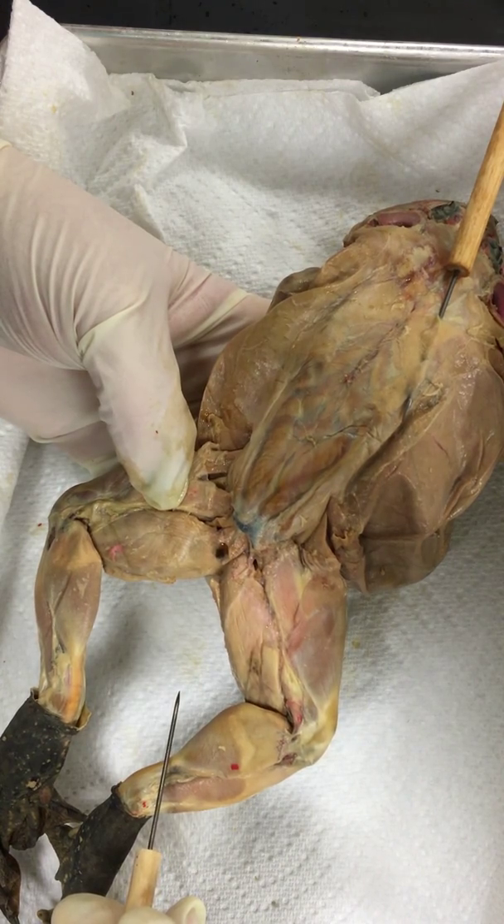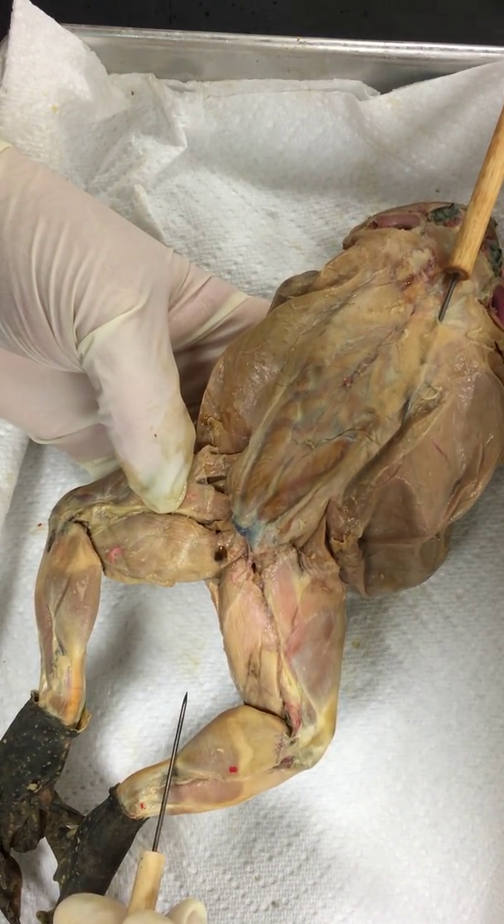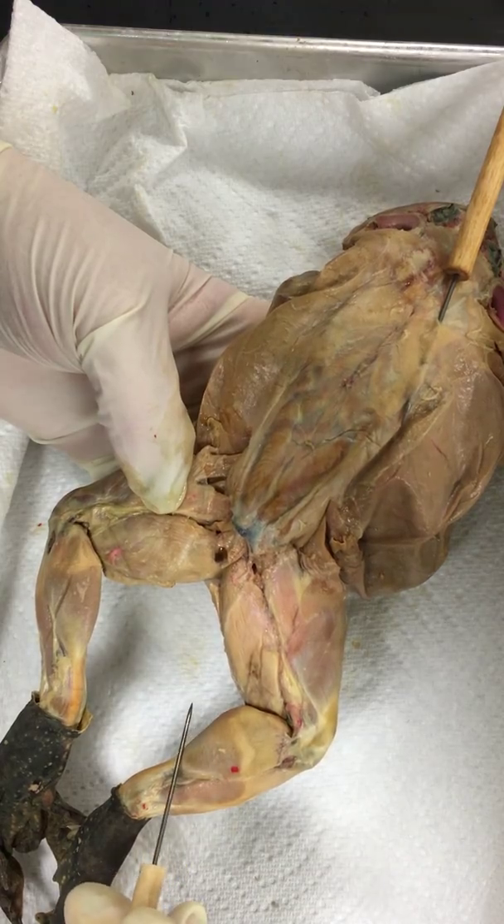And once again, those are the dorsal muscles of the frog — objective four.